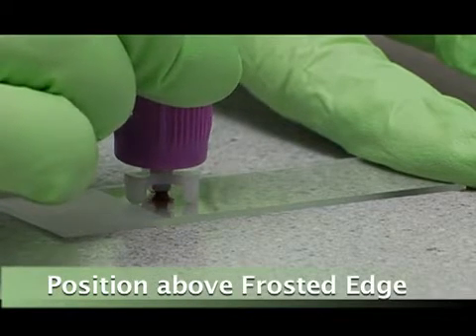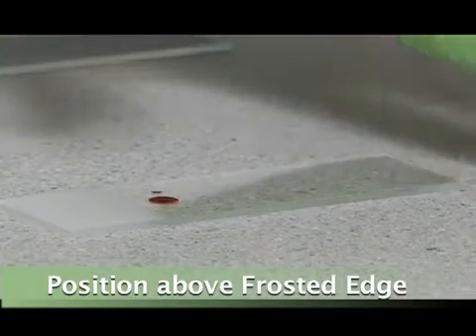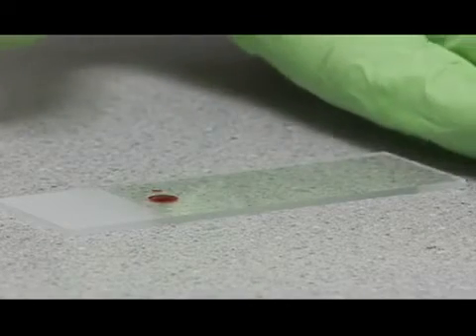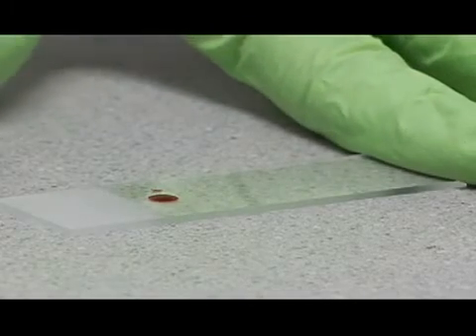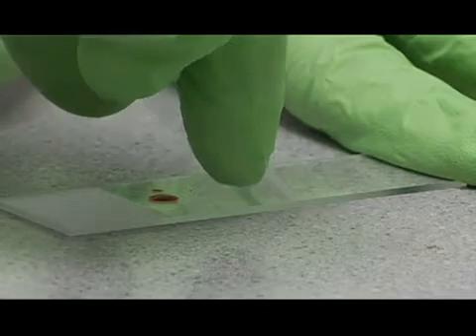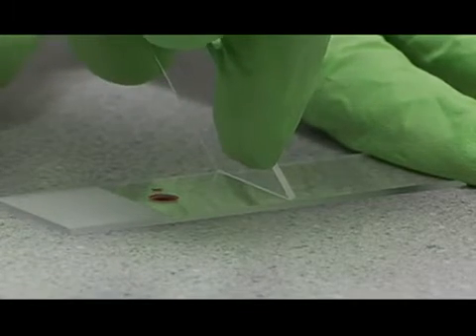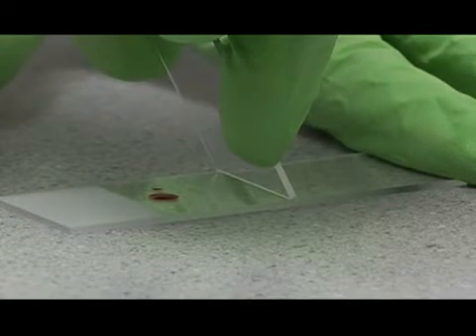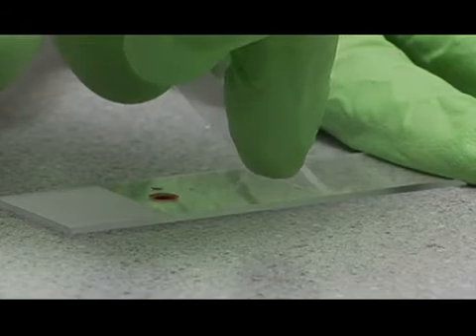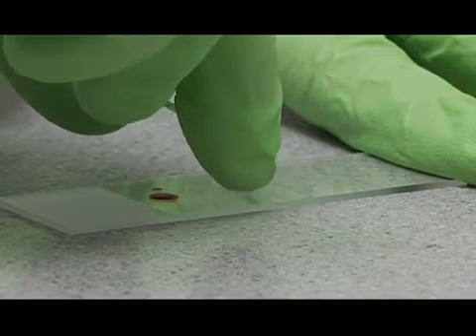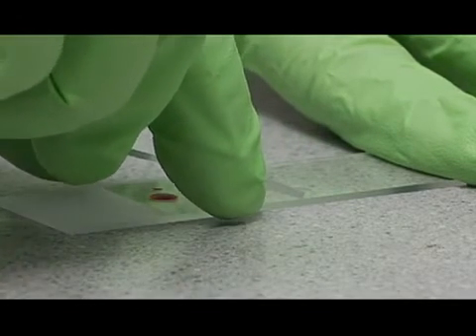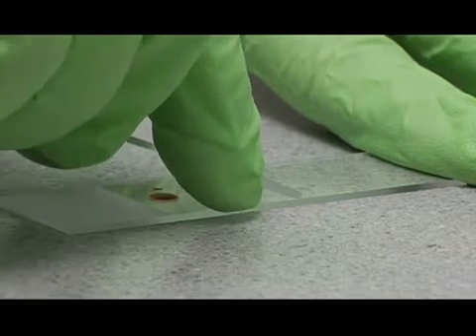Now place a drop on your slide. That's a good size drop there. Take your spreader slide. Now your first slide was a little too thin. You can make it thicker by increasing the angle like this. If it was too thick, you can make it thinner by decreasing the angle like this.